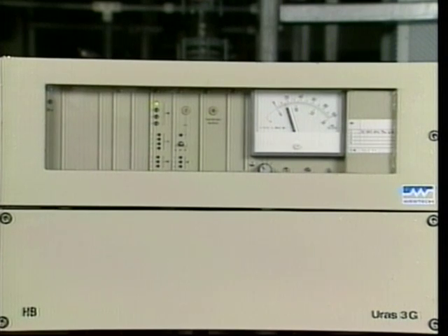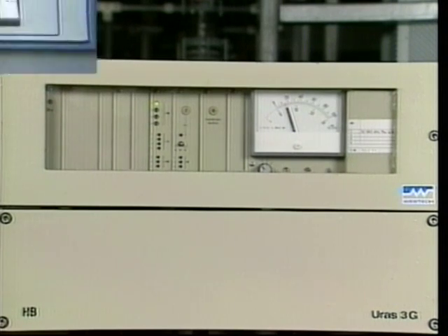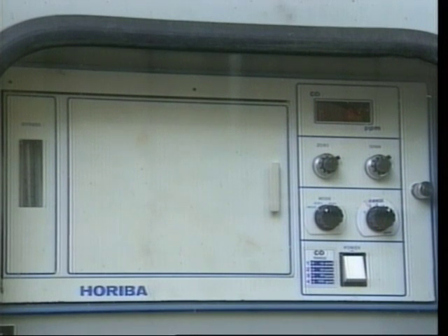In the next segment, you'll learn about source maintenance. But for now, review the material we just covered in your workbook.